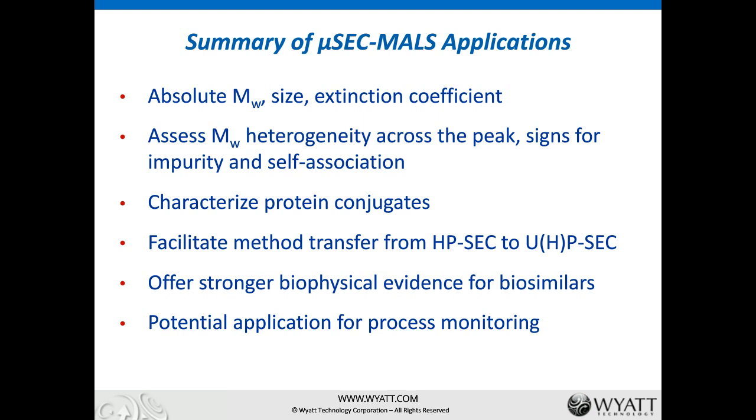Well-established SEC-MALS applications, such as protein conjugate analysis, are now transferable to the UHP-SEC platform. We also just talked about a potential unique application for process monitoring or at-line monitoring.